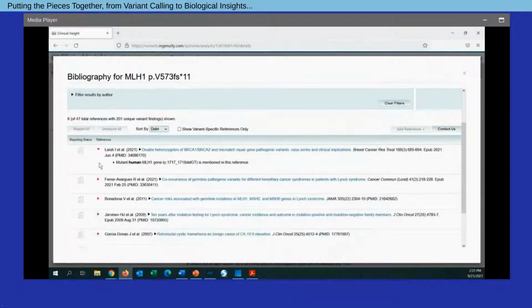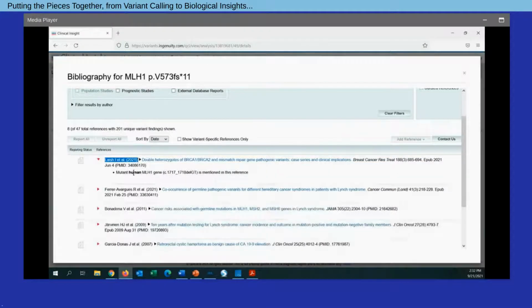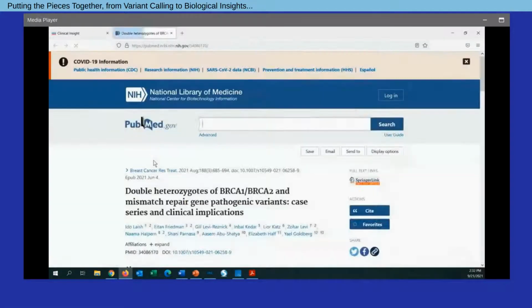And very nicely here, just to show you the frequency and the nature of updating our knowledge base and our literature curation efforts, this second article here actually is the article from which we've captured these Lynch syndrome samples. So that shows up. We've curated that through our efforts. And then also very nicely, we actually have an even more recent publication. This is from June of this year that also identifies this variant in a slightly different context. And for any of these, we can link out to PubMed and interrogate the article in further detail.